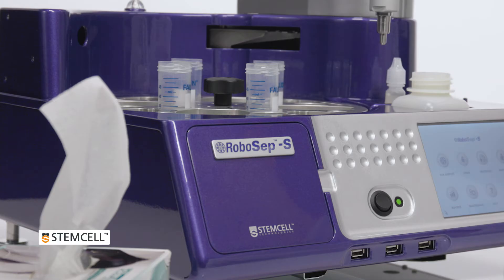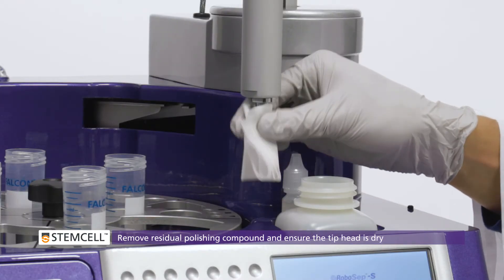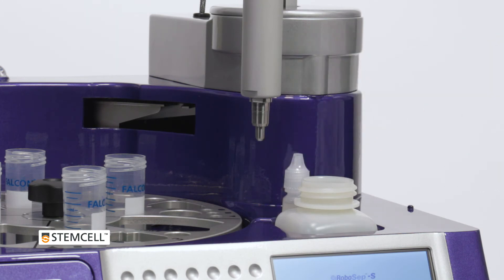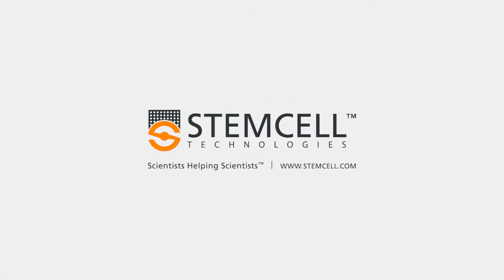Next, remove residual polishing compound with a clean Kim Wipe by wiping in a downward motion. Only use the RoboCEP Tip Head Polishing Compound on the tip head. Do not apply any other cleaning reagents.